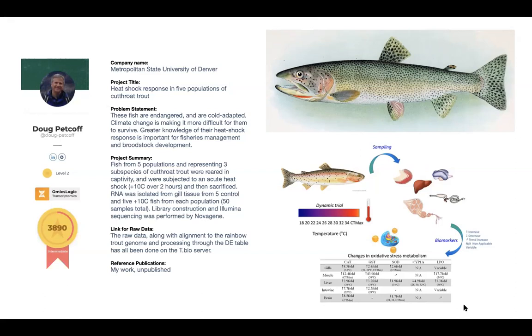Okay, so biomarkers that differentiate between their tolerance towards heat. Yes.